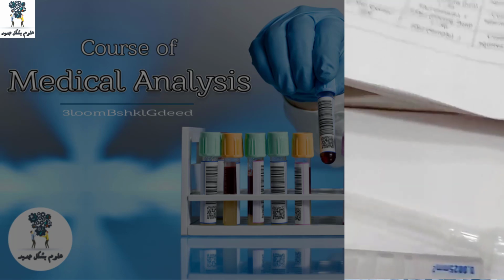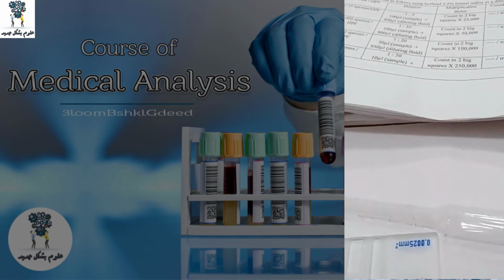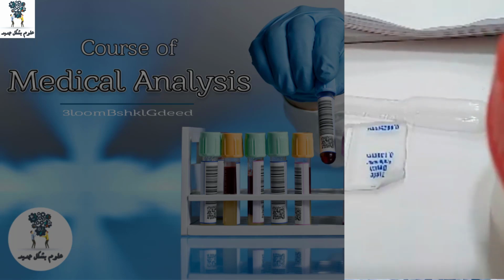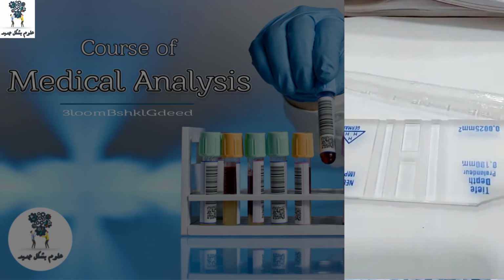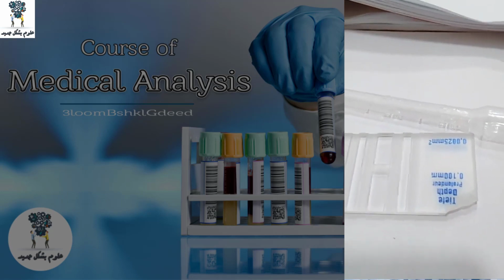So, back to our case. At first we didn't find any sperm. Then we checked again and again, you find 3, 4, and then you put it in the hemocytometer, you find 2 or 3 or 4 sperms.